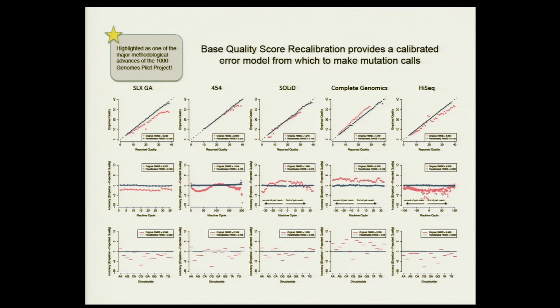And then moreover, perhaps there are other sequencing vendors that try to do a better job when you look at it in this view, but through whatever they've done to make the quality scores accurate, they've added these crazy systematic biases.